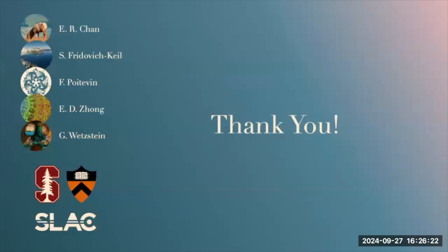But if you try with a single map, it behaves the same as with simulated data. It depends. If you have residual compositional heterogeneity, so complexes that bind and unbind, this is not handled by the method very well. Most of our experiments with experimental data are focused on this heterogeneous setup, and we have preliminary results on that, but not on the homogeneous case, which sounds less interesting to us.